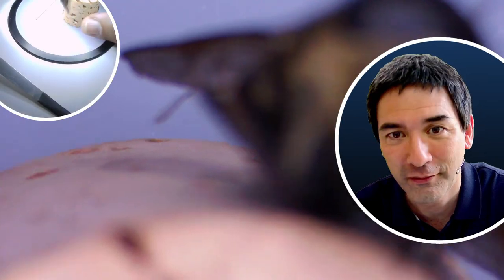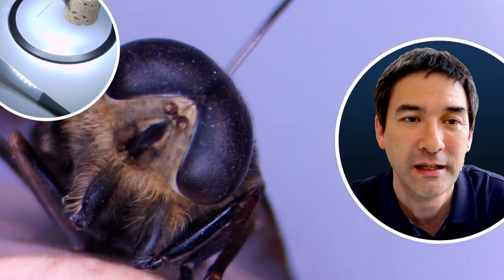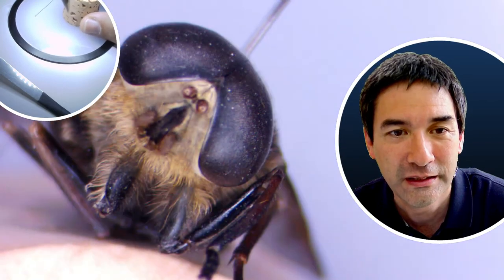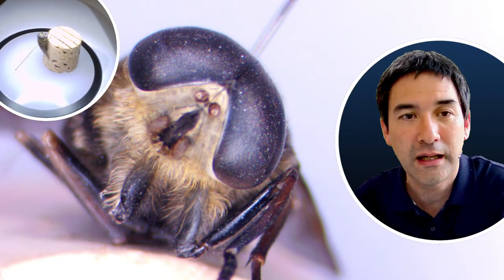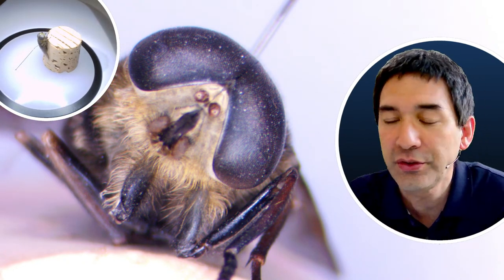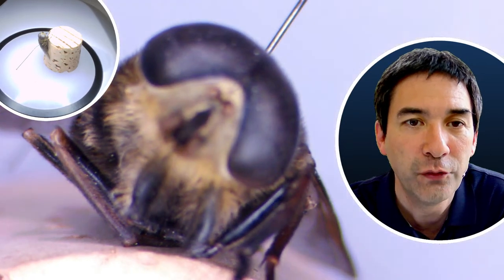One of my favorite specimens — I recently caught it — this is a fly. This kind of shows what stereo microscopes are really good for. I already showed it to you last week, but just for the sake of demonstrating what they're actually good for. It's an opaque object — it does not allow light to go through. What you can do is focus all the way down and you see the different parts come into focus and go out of focus.